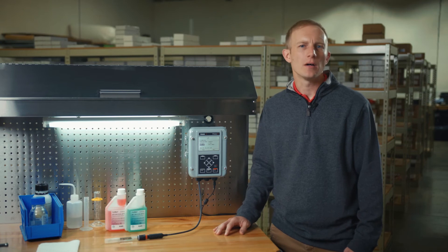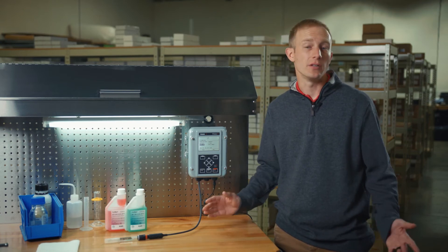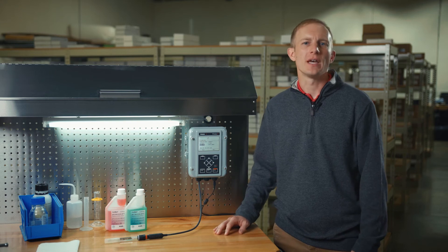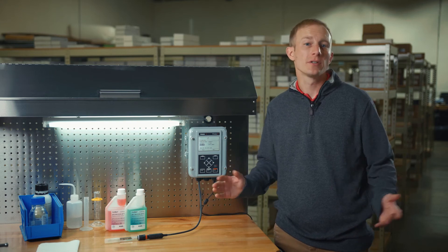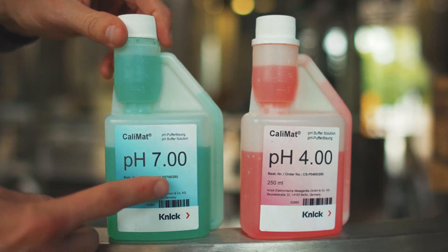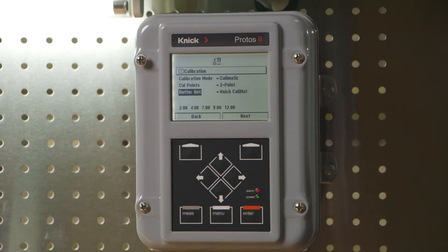Since we are using automatic calibration, it's very important to have the proper buffer set selected in your Protos transmitter. This ensures automatic recognition of the buffer's value as well as automatic temperature compensation during the calibration process. The Protos has numerous buffer tables stored within its software for selection by the operator. It's important to note that NIST technical is most commonly used. Verify your buffer values by cross-checking the labels against the values on the bottom of the screen.